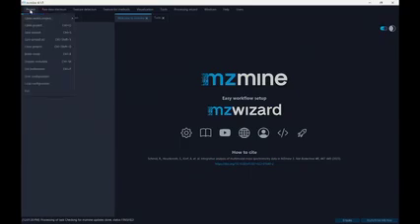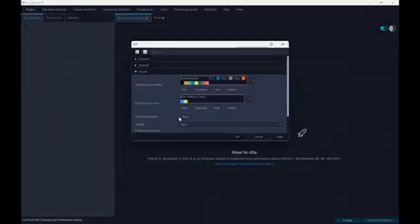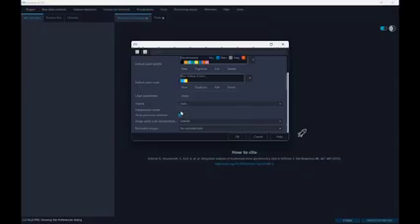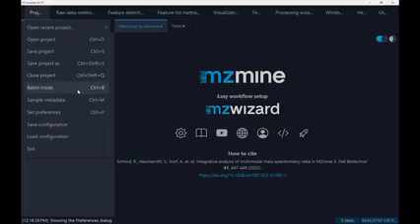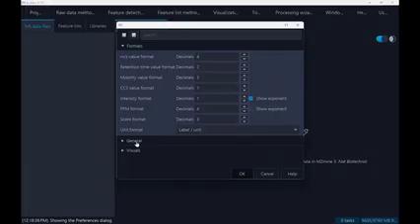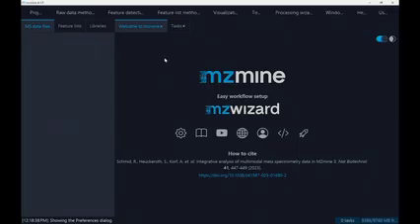Okay, I will try to make it bigger, actually. Did not think about this. Okay, that's huge. Okay, so try to open MZmine, and if you have any issues, there are some people around you can look for and then point to them.